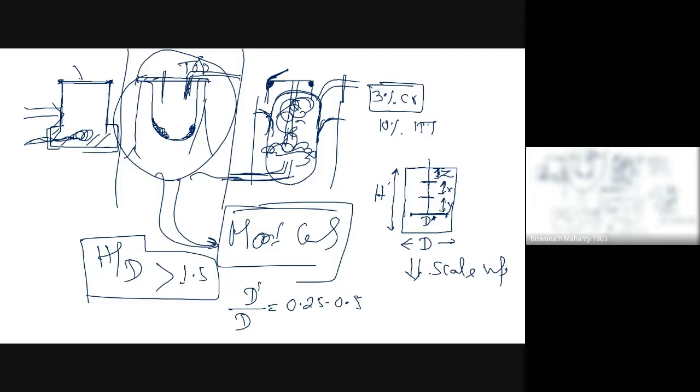And when I want to make a bigger fermenter, we increase the dimensions of this picture in such a way that every aspect enlarges, like making a small Xerox into a big-size Xerox, micro Xerox to mega Xerox.